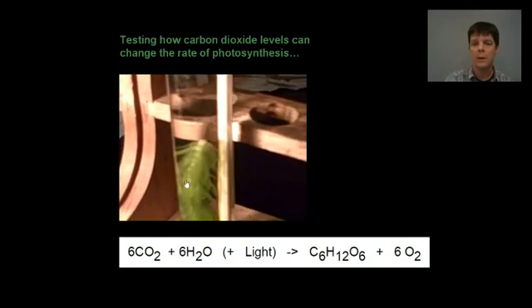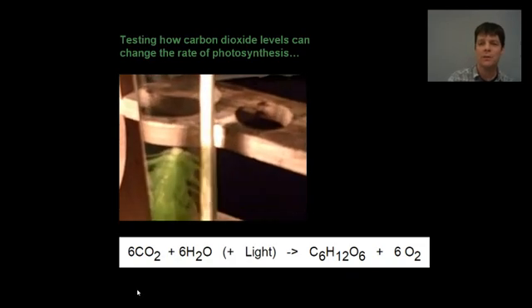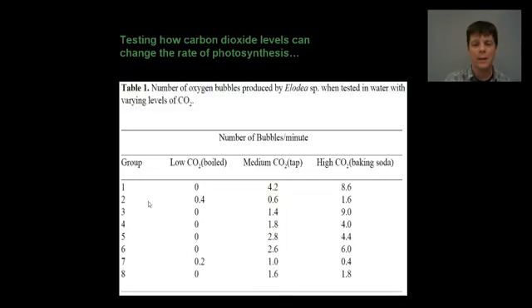So, by running the three trials, we're able to test how changing the level of CO2 is going to change the rate of photosynthesis. Now, I'm going to pause my video here. This is a sample data set, which gives us an idea of what the data from this experiment will look like when it's run by my classes or other classes.